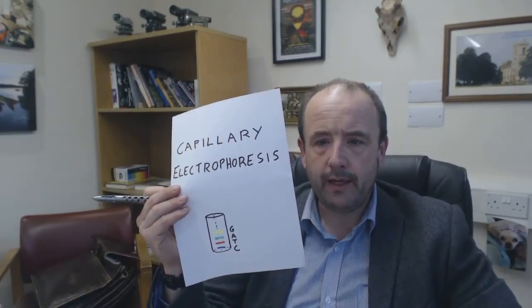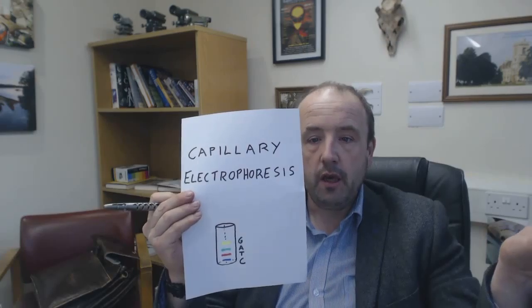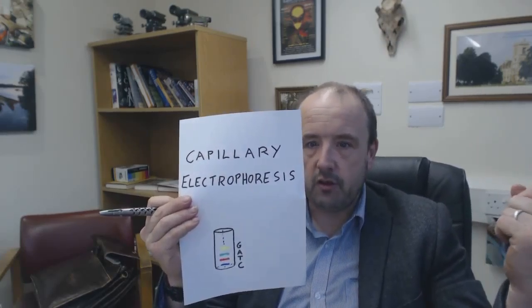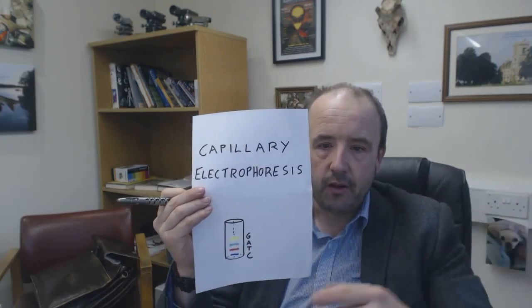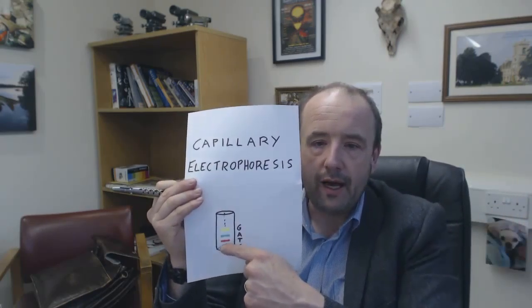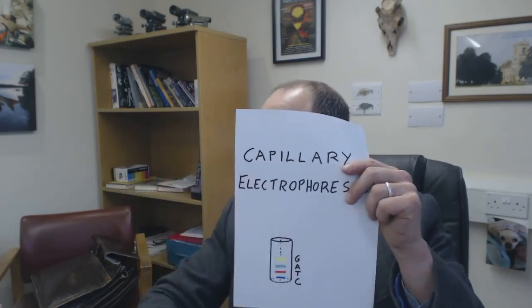Then the capillary is bombarded with laser energy, causing the dideoxynucleotides, the labeled bases, to fluoresce. So here we see a point of fluorescent blue, red, green and yellow.